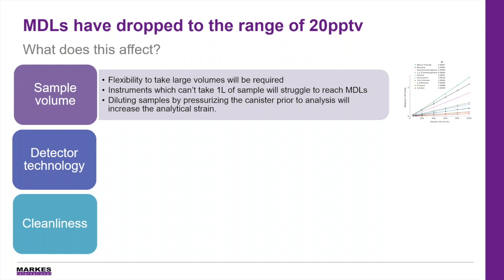Another consideration is actually the process of pressurizing canisters prior to analysis. This effectively dilutes the sample and will add extra analytical strain. Certainly, taking larger volumes again, if we're pressurizing the canisters, will become very important.